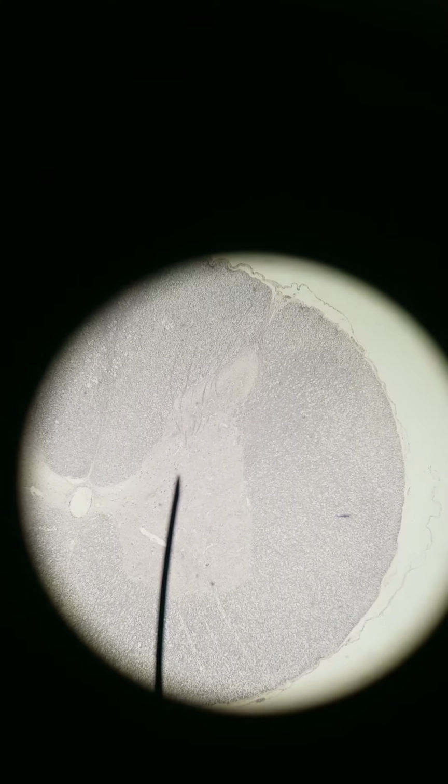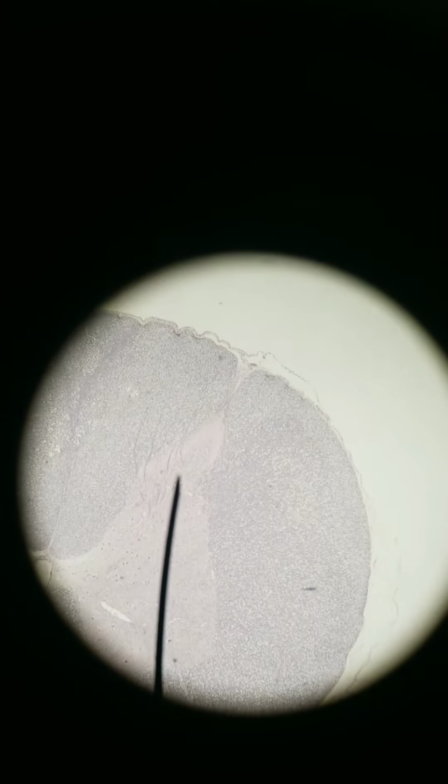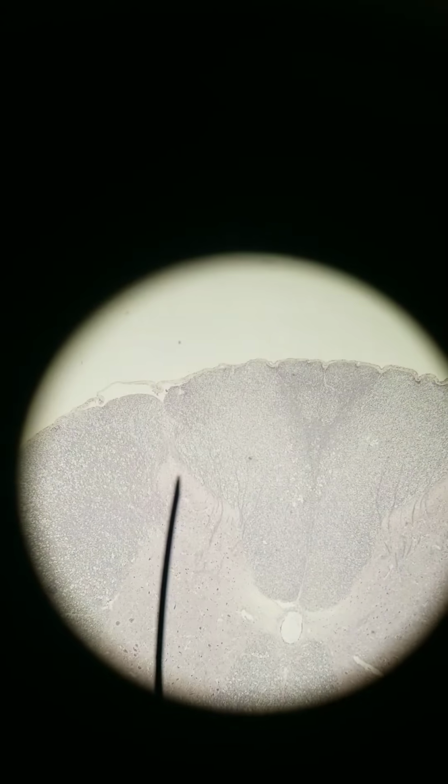But this is where we actually find most of the neurons, or all the neurons. All the neuron cell bodies are found in this butterfly shape. It's the gray matter. This is the gray matter of the spinal cord. White matter, where you find axons, that's all on the outside here. So white matter for the spinal cord is on the outside, gray matter is towards the inside. So it's opposite of what we see in the brain.